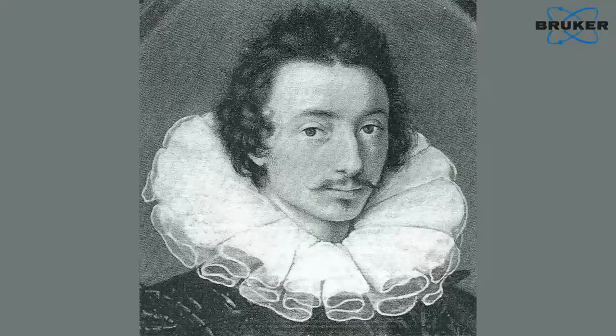A lot has been done on Hilliard, because you can compare what he wrote with what he did in his miniatures. But there's very little that has ever been done with Isaac Oliver. He's much more of an unknown personality, and that was one of the reasons why we were really interested in him.